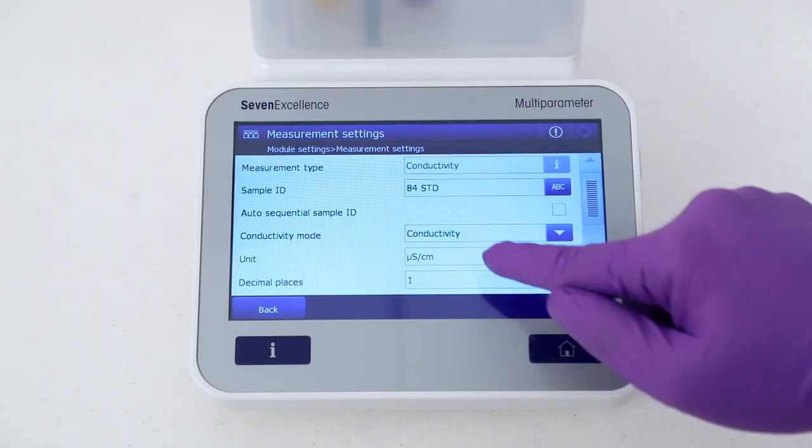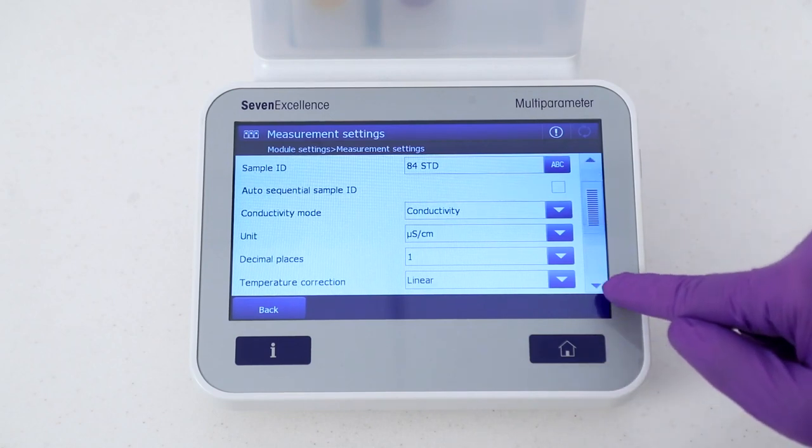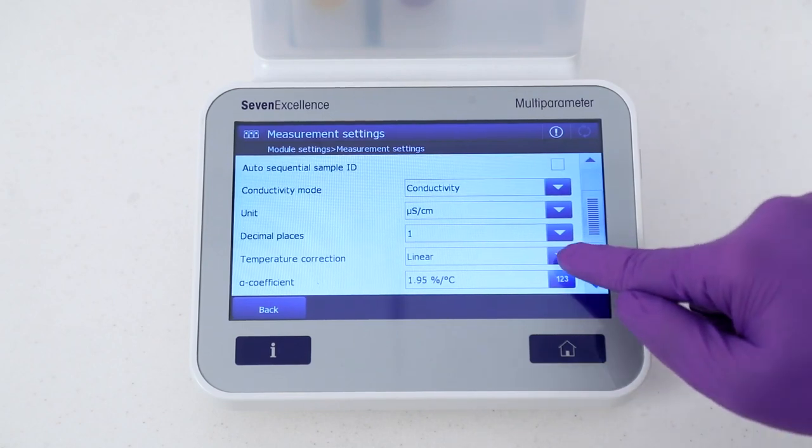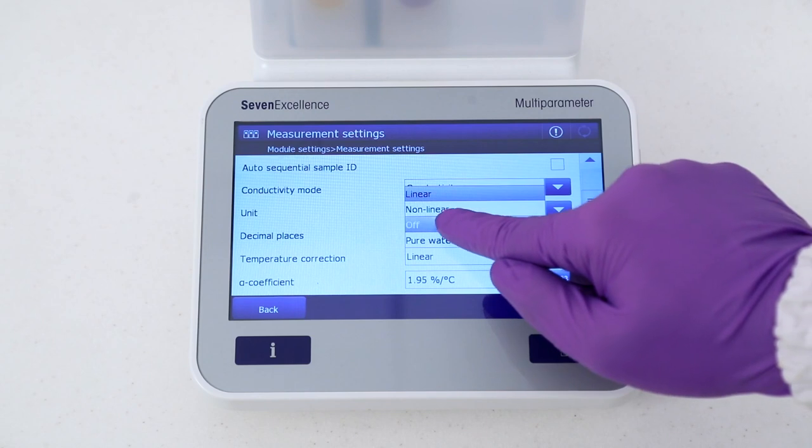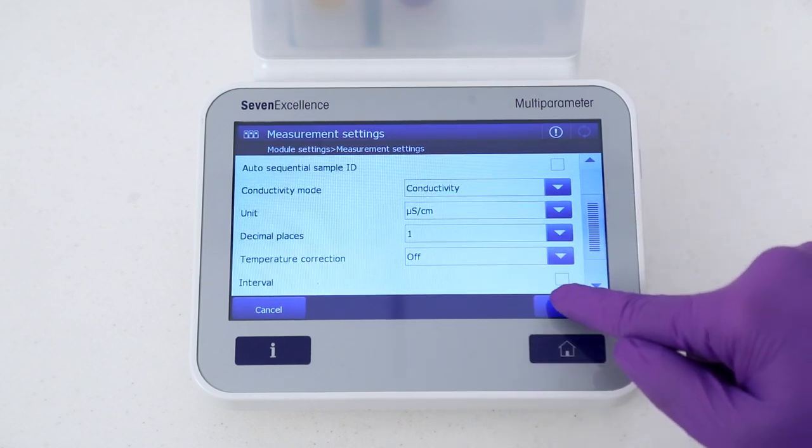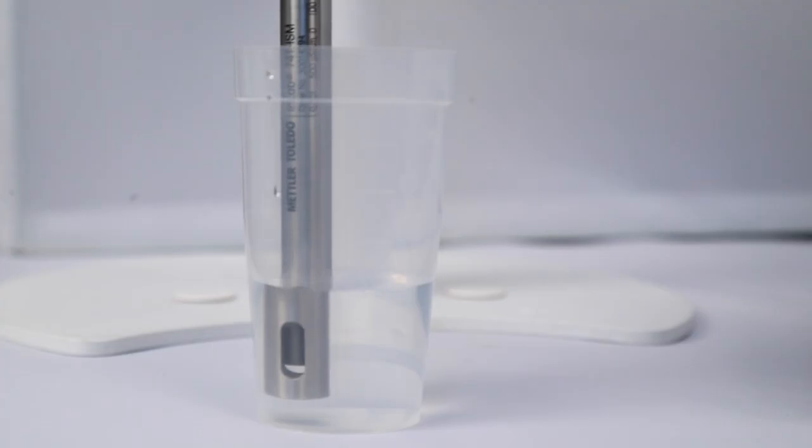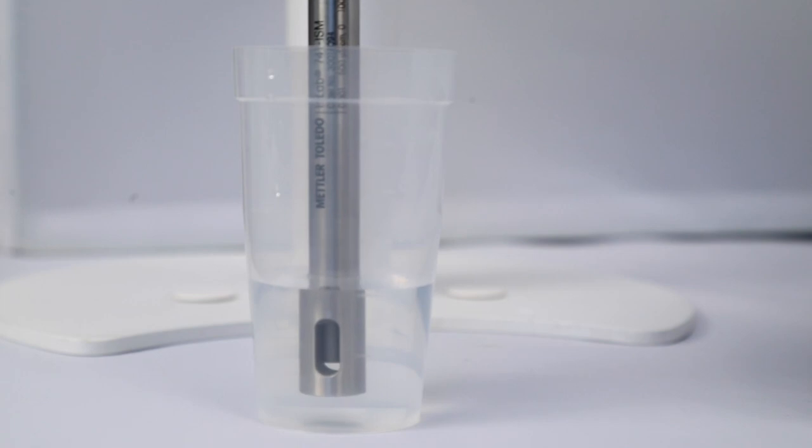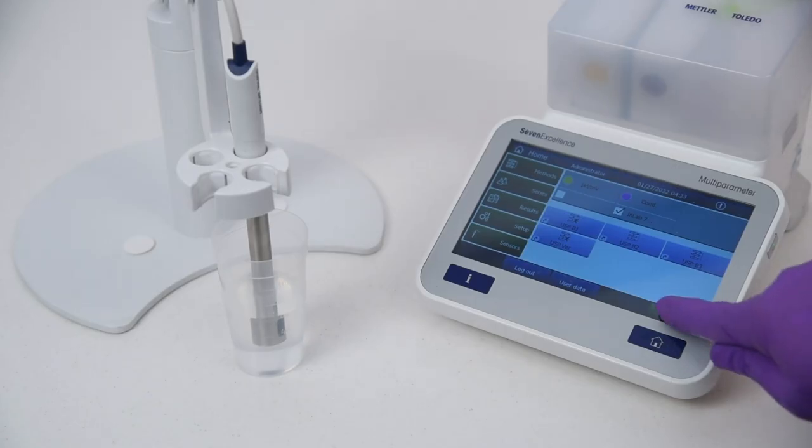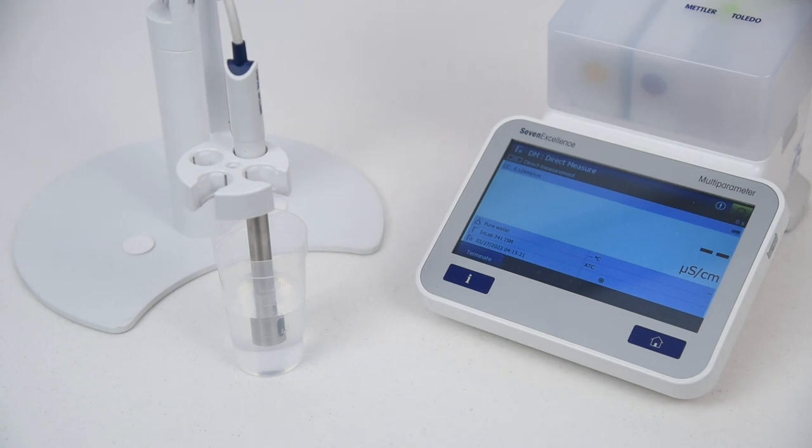First, turn off the temperature correction in the meter settings. Ensure that no air bubble is present at the surface of the poles of the sensor. Perform the conductivity measurement. Compare the result with the conductivity value given in the limit table.